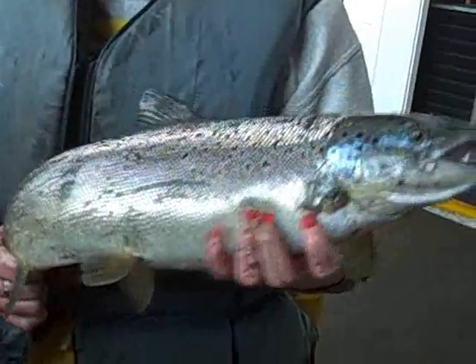1.99 kilograms. We clip the fins off of all of our Atlantic salmon so we can tell which age they are. By knowing what fin clip they have, we'll be able to say what year we actually took the egg for this fish.